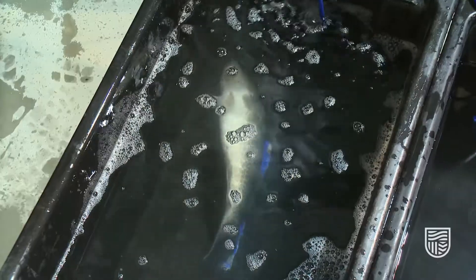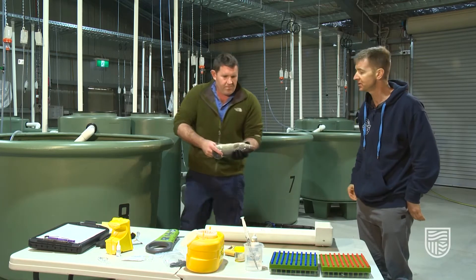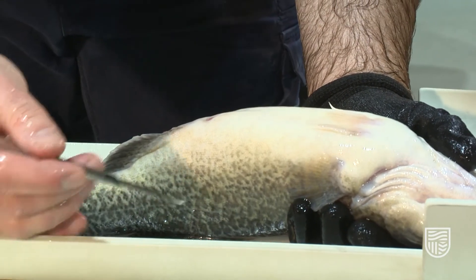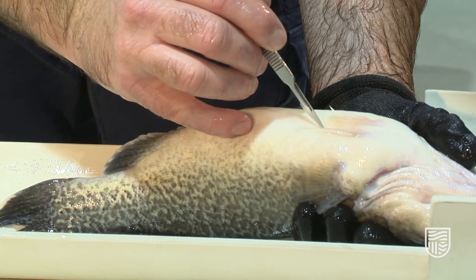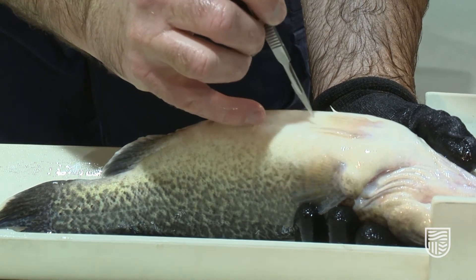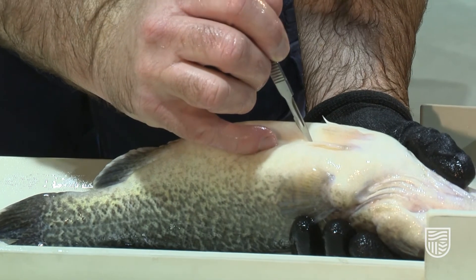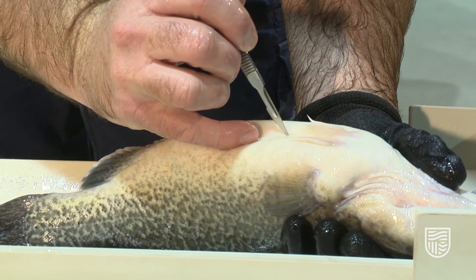We're now demonstrating a third technique: scalpel insertion. It's just another option for tagging fish safely. It's the same principle as the needle technique, but instead of using the needle we're using a scalpel to make the incision — scraping a few scales away, then making a small incision into the body cavity of the fish. The needle can then be placed through that incision into the body cavity.